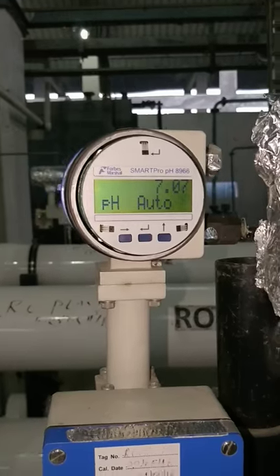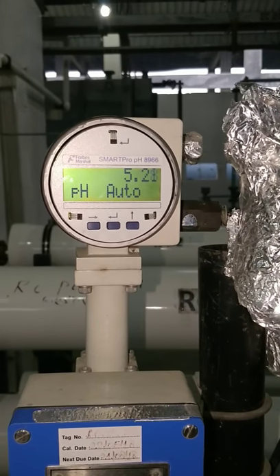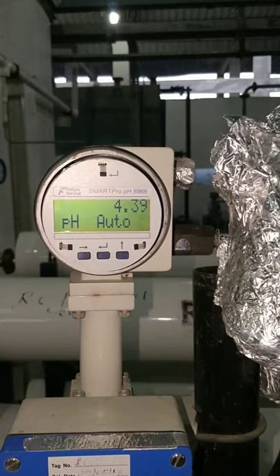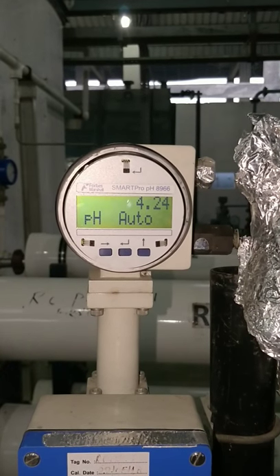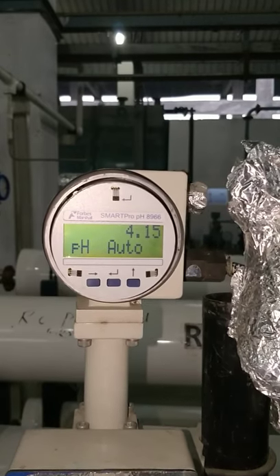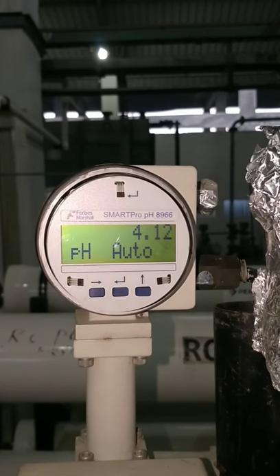Now insert the next sample. We have inserted the probe in the 4 PH sample and you can see the readings are going down. The slope and offset will be calculated based on the two-sample dual point calibration. If there is any deviation, a calibration error will appear in the message display box. The reading shows 4.1 and will come down to approximately 4.05, but it will take some time — we will wait 10 to 15 seconds.